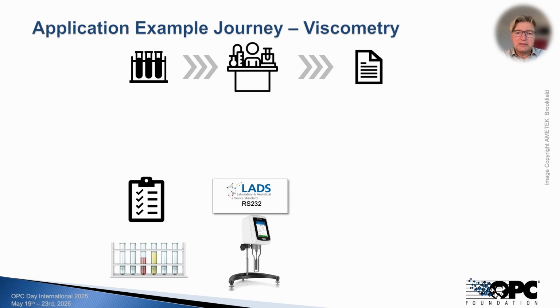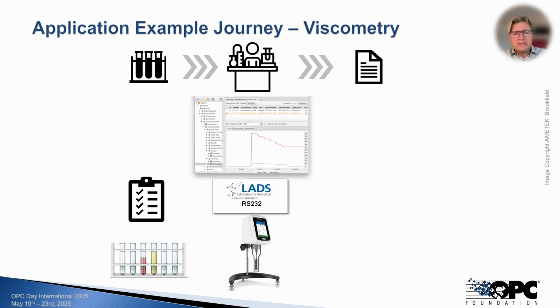To illustrate the need for seamlessly integrated FAIR data, let's walk through a practical example: the digitalization journey of a viscometry measurement process. In the first step, we connect a legacy viscometer, equipped only with an RS-232 interface, to the OPC UA world using a LADS OPC UA gateway.